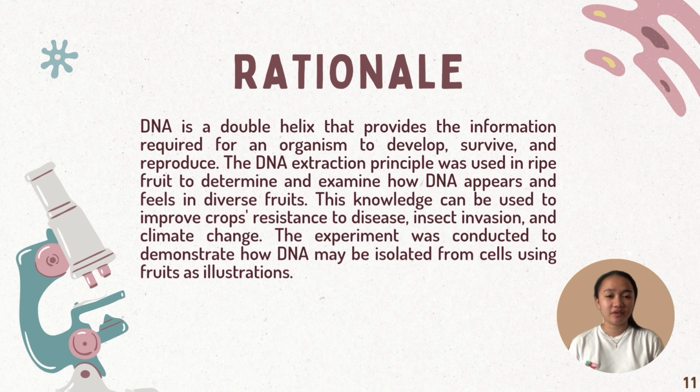Before we proceed with the methodology, let us first discuss the rationale of this experiment. DNA is a double helix that provides the information required for an organism to develop, survive, and reproduce. According to biotechnology, the capacity to extract DNA is critical for researching the genetic causes of disease and developing diagnostics and treatments. It is also required for forensic science, genome sequencing, detecting viruses in the environment, and determining paternity.